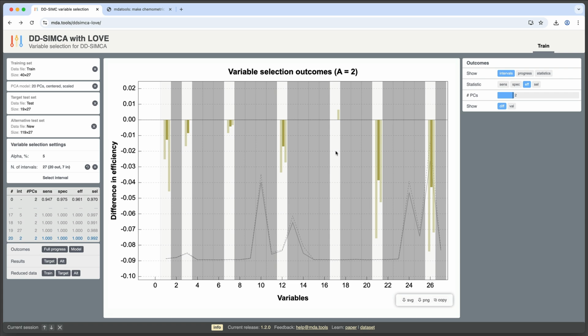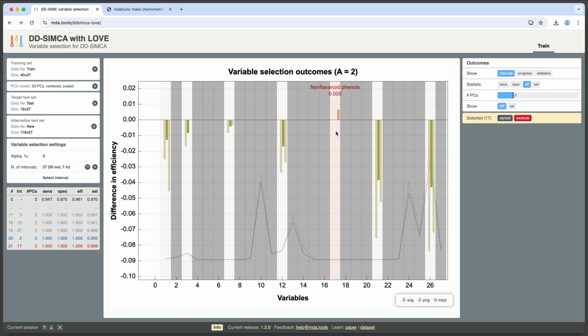All right, so we're almost done. You can see that there is only one variable left, which actually does not change the model. And look at these numbers, right? We got ideal numbers just by excluding these variables one by one, carefully selecting the variables for exclusion.